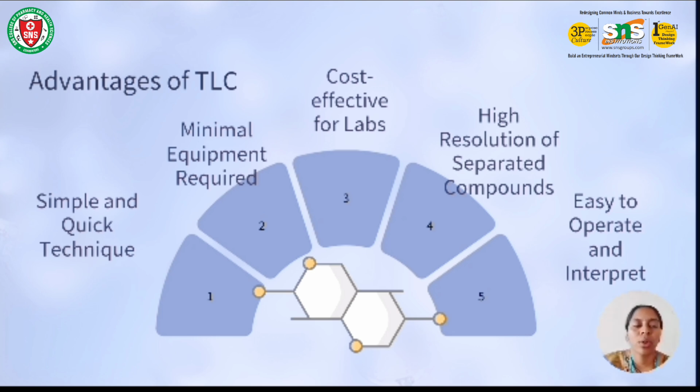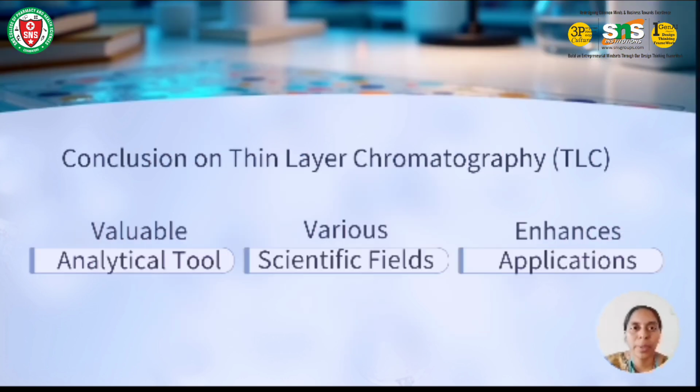Then it is cost effective for labs. Then high resolution of separated components. Components can be easily separated, and it is easy to operate and interpret.